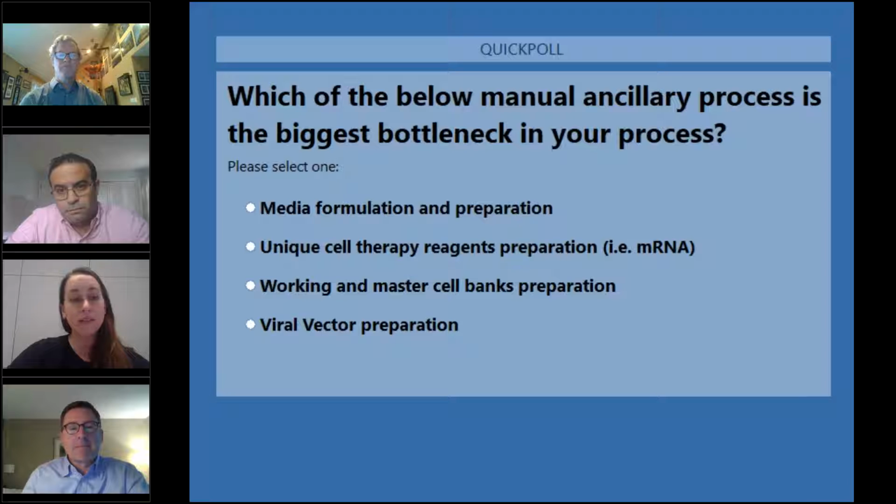Yeah, absolutely. Given the cell type, it can be different scales, different sorts of volumes that you're working with. Different size cells need different sorts of mixing components, et cetera. And so all of those different things have really pushed us towards looking at different pieces of equipment across the landscape, really.